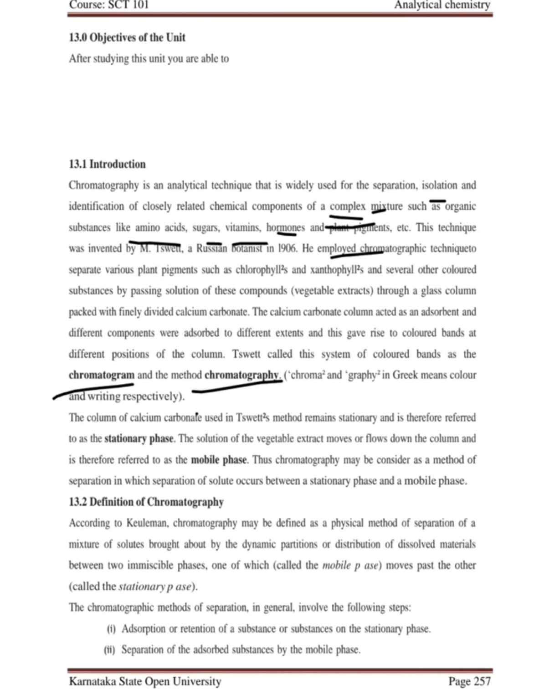Here the column is used for separation of the compounds, which is known as the stationary phase, and we use some solvents to separate the mixture.